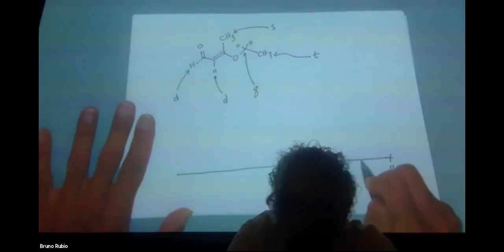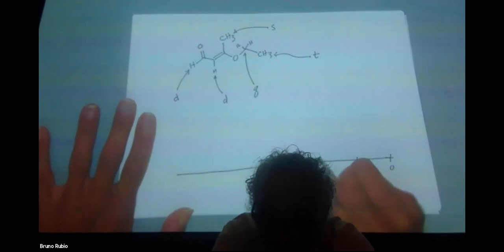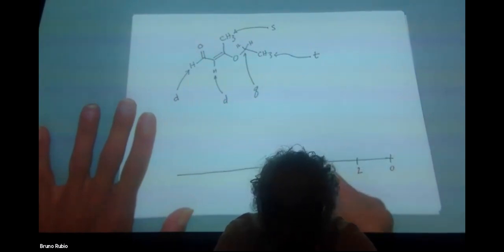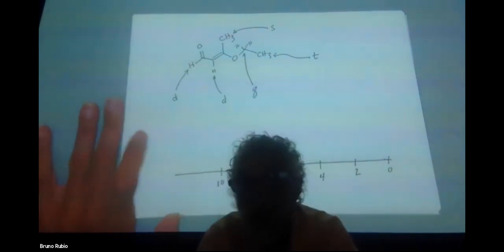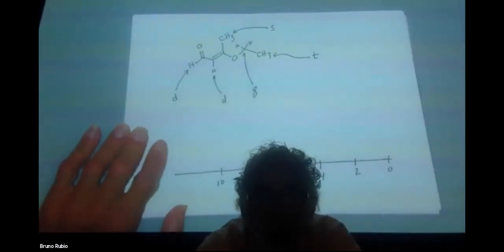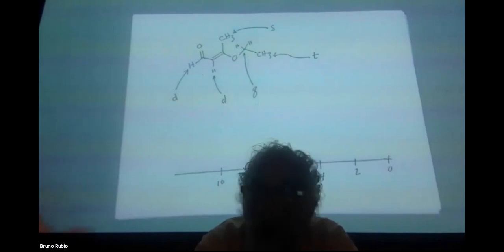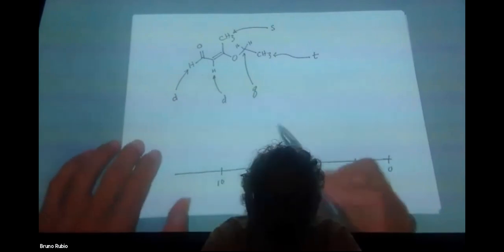And like I said before, it's not an easy thing unless you've memorized the NMR chemical shifts or are looking at a table of NMR shifts. So I have this little table here that I put on the course website, and one of the entries that I see on this table is that an aldehyde proton absorbs at about 10 ppm, right? Where am I getting that from? I'm looking at a table of NMR chemical shifts, and this guy absorbs at about 10 ppm.